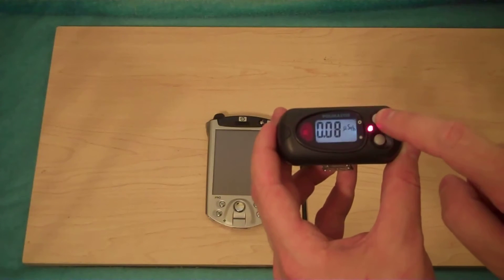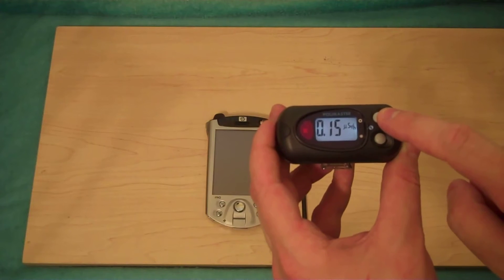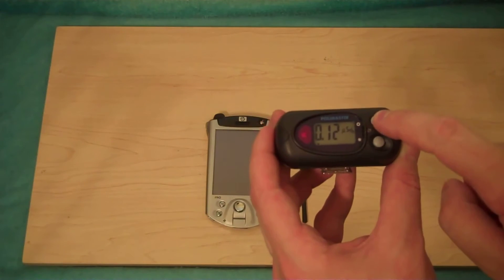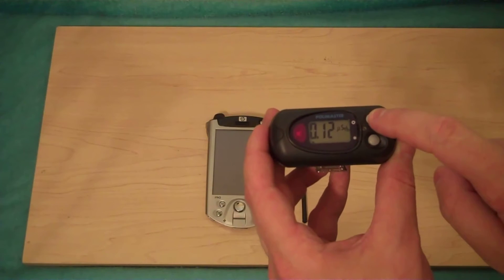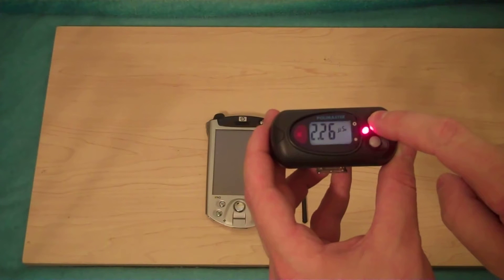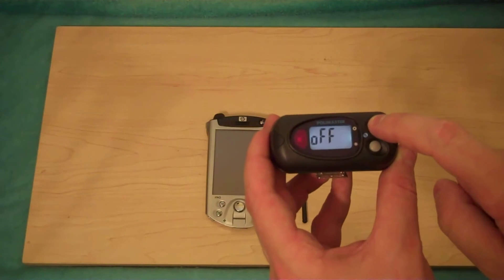Currently it's in search mode. When an isotope is near it, as you can see, the readings go up and they move around pretty rapidly. You can also switch to the background radiation mode — this is in microsieverts — and hitting the button one more time, we can actually see that we have absorbed 2.26 microsieverts since this was last reset. We can even cut the unit off if we wished.